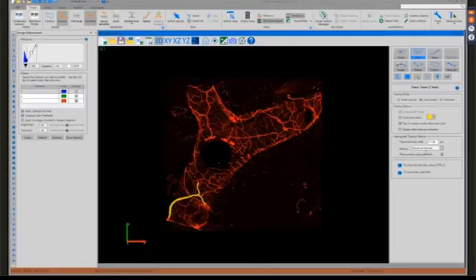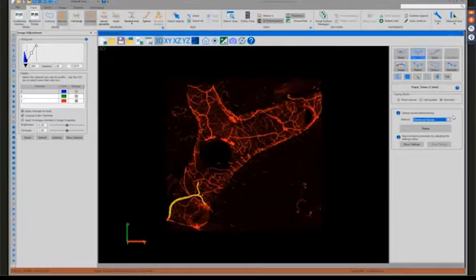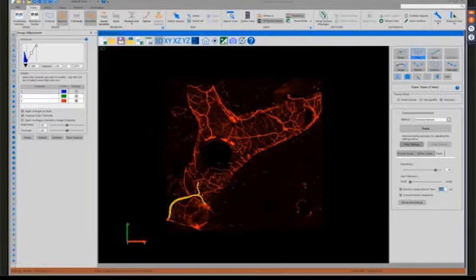So now that we know that directional kernels works pretty well in this image, we'll go over to our automatic tab. And again, you'll see the same 3 methods are available for automatic tracing as well. There are settings here. You can manipulate these settings to improve the tracing accuracy. Things like increasing the trace sensitivity and removing traces shorter than a certain micron.